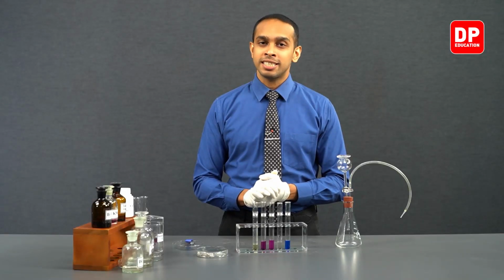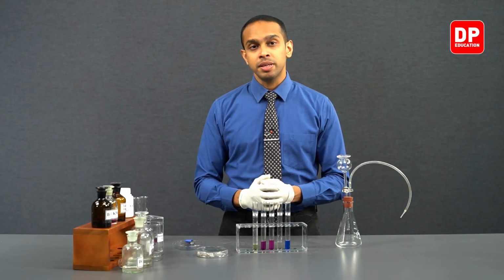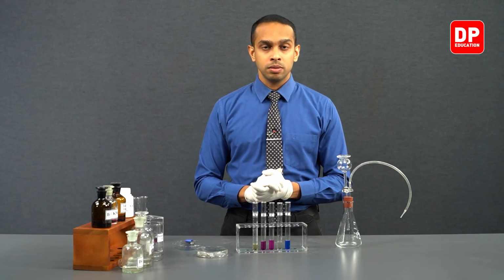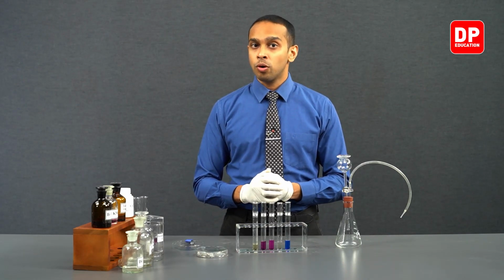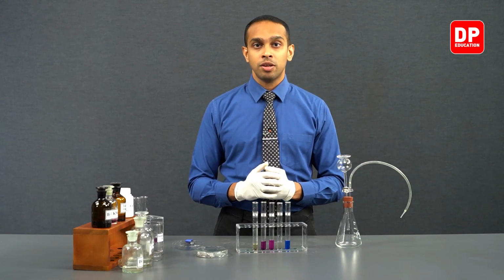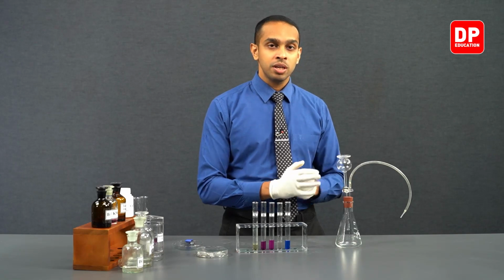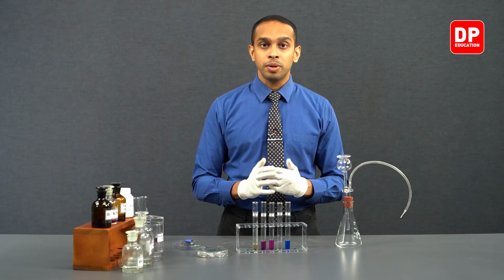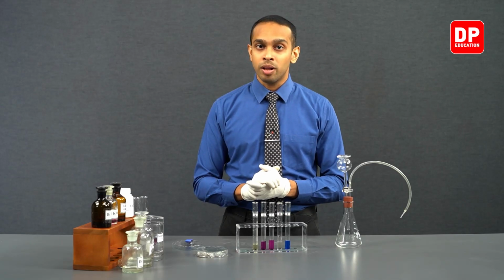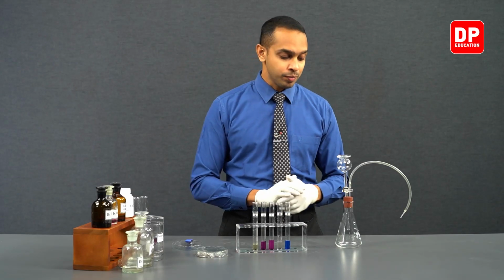Now students, as I mentioned earlier, we will be reacting calcium carbide with water. When we are adding water to calcium carbide, we have to make sure that we regulate the amount of water that we add, so we can use the Thistle funnel to make sure that we add water to calcium carbide in a well regulated manner.